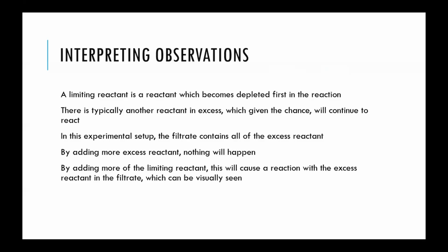And then in the second one, what is the theoretical yield? How much of the calcium hydroxide is actually created? And to do that, you need to figure out how much limiting reagent is there in the first place.